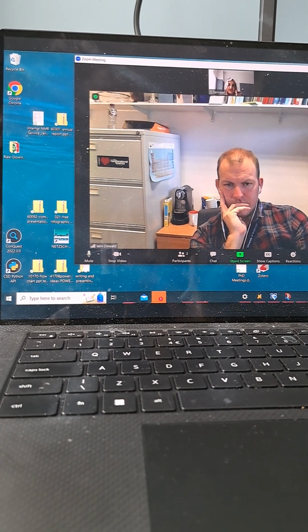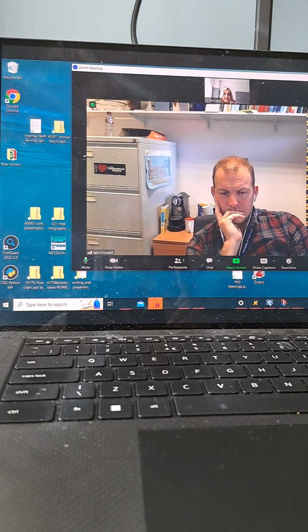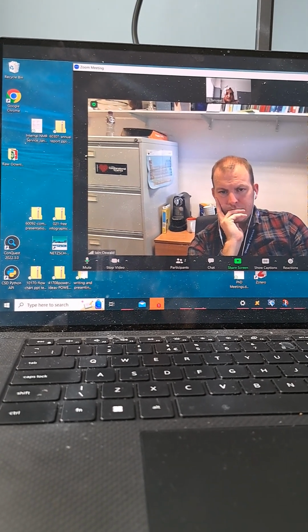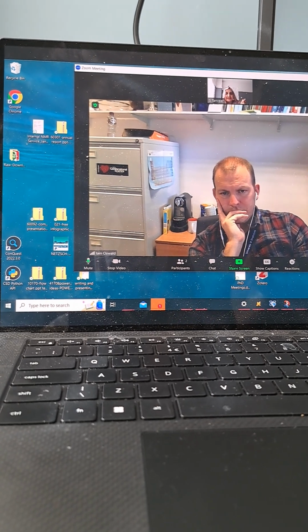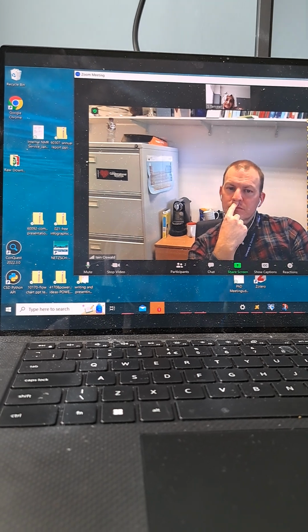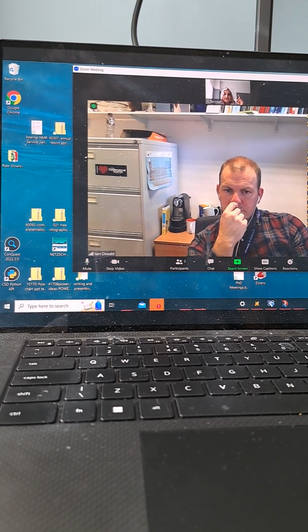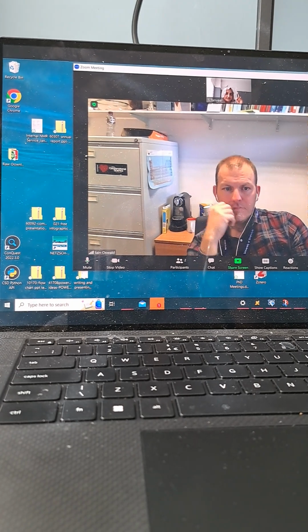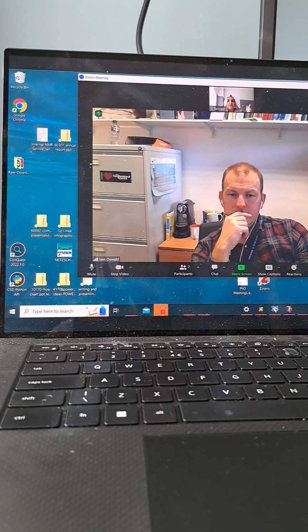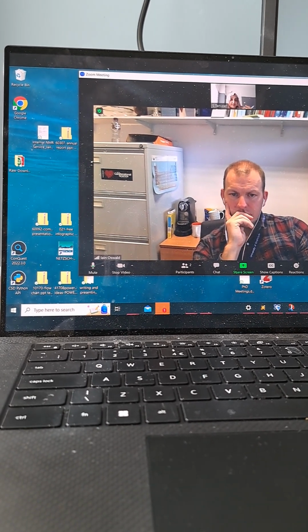I want to break my presentation into 2 main things. One is the disproportionation, the pH dependent solubility experiment. We will concentrate half of the meeting on this. And the second is I want to focus on the water bridge salt hydrate definition plus the classification, because now I have some idea of how we can make a motif and then put it to a search. So I can ask them to give me an idea so that we can build up that thing.